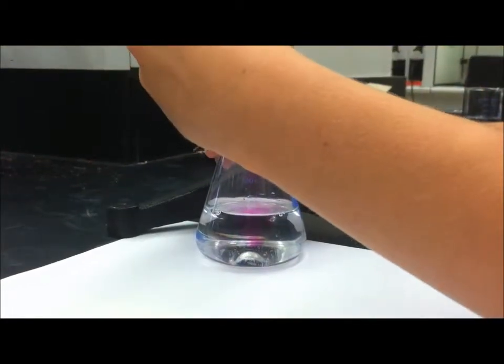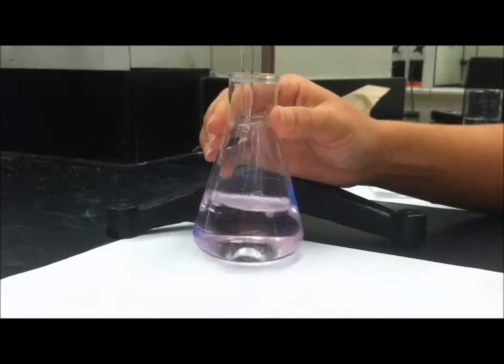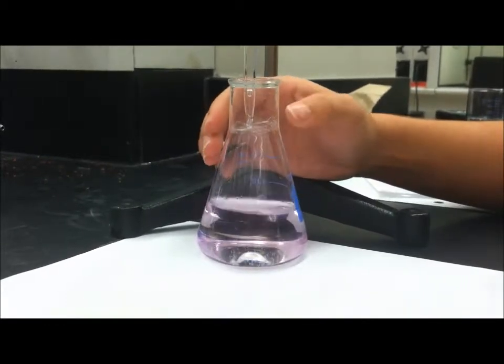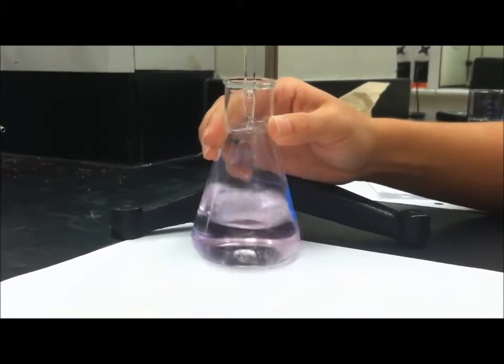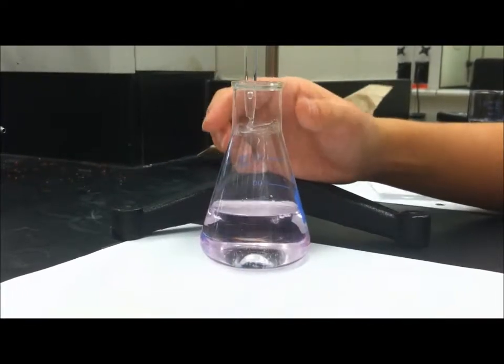Make sure you're adding very slowly because you don't want to get too much. You want your concentration at its endpoint. It will be a light pink. You want it to stay at the endpoint for about 30 seconds so it maintains that pink color. If it doesn't, then you need to add a drop until it maintains that pink color.